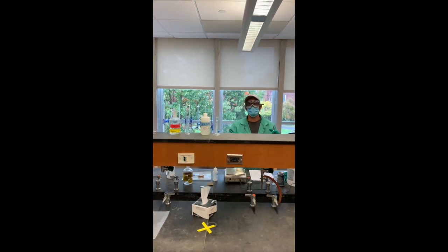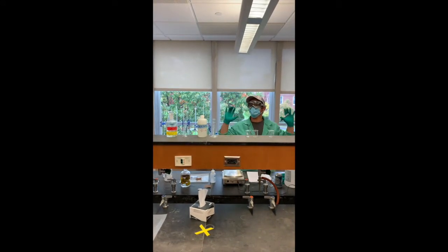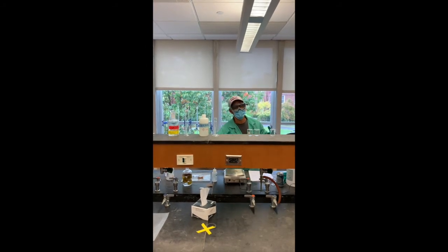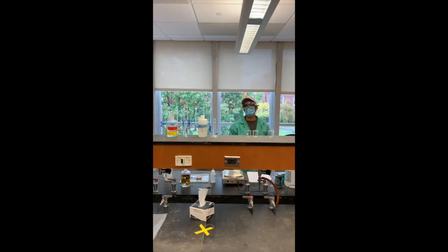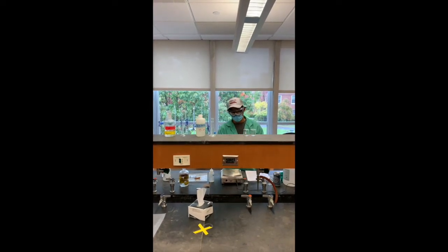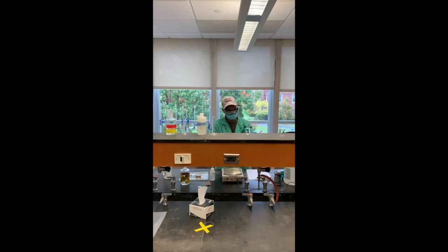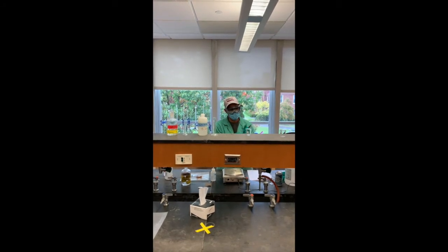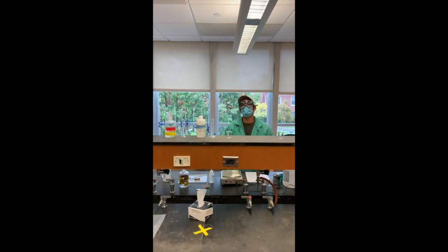What you'll find on the lab bench is 3 50 milliliter beakers. This is just going to be an observing thing. Your instructor is actually going to initiate this once you get the reaction going on the side. So there are 3 beakers, which will be used for the 3 reactions of the aluminum. We're going to be reacting 6 molar hydrochloric acid, 6 molar sodium hydroxide, and then water.